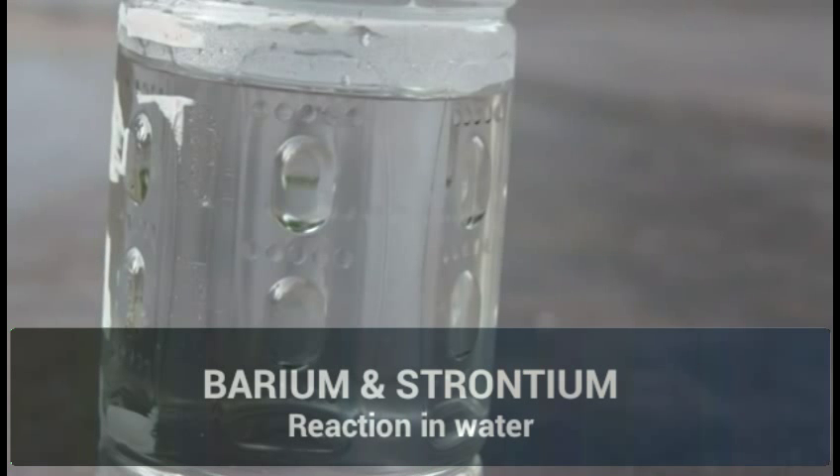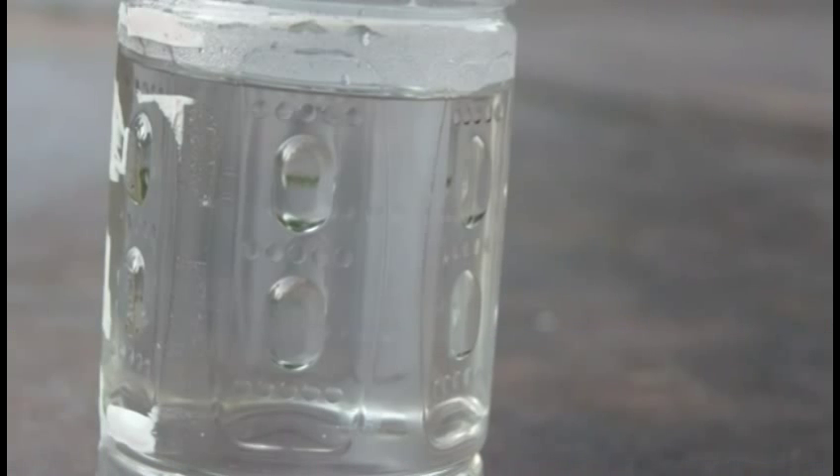Hello again. Today we're basically messing around with barium and strontium because they're in the alkali earth metals group. They are not as reactive as sodium and lithium, sodium being more reactive than all the ones that I mentioned. So we're just going to test which one is more reactive.